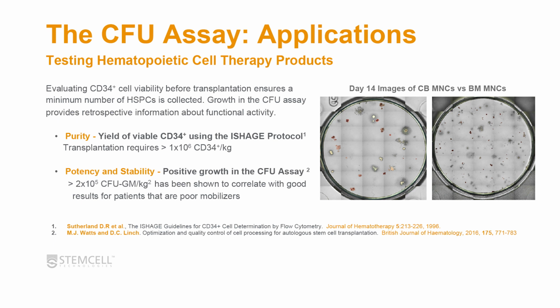And this slide actually shows you that the CFU assay is not only important as a QC test, but as I mentioned, the dose that's used when you're collecting hematopoietic stem cells before you use them for therapy, you usually base that dose on the number of CD34 cells. And historically that was done, of course, because we were talking about fresh bone marrow, or in the early days of mobilized peripheral blood, that you could actually do flow, identify the purity of CD34, do it right at the time. It only takes an hour or two to do flow.